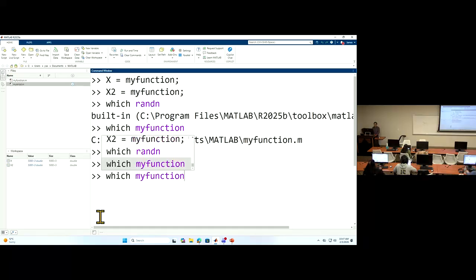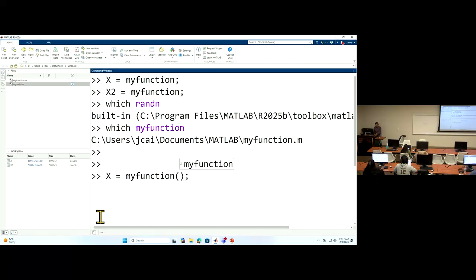As I said, we generate, for instance, not only 5,000 cells, because now I'm not giving any chance to change the number of cells. If I want to generate only 500 cells, I cannot do it, because my current definition of the input does not allow me to change this to 1,000.